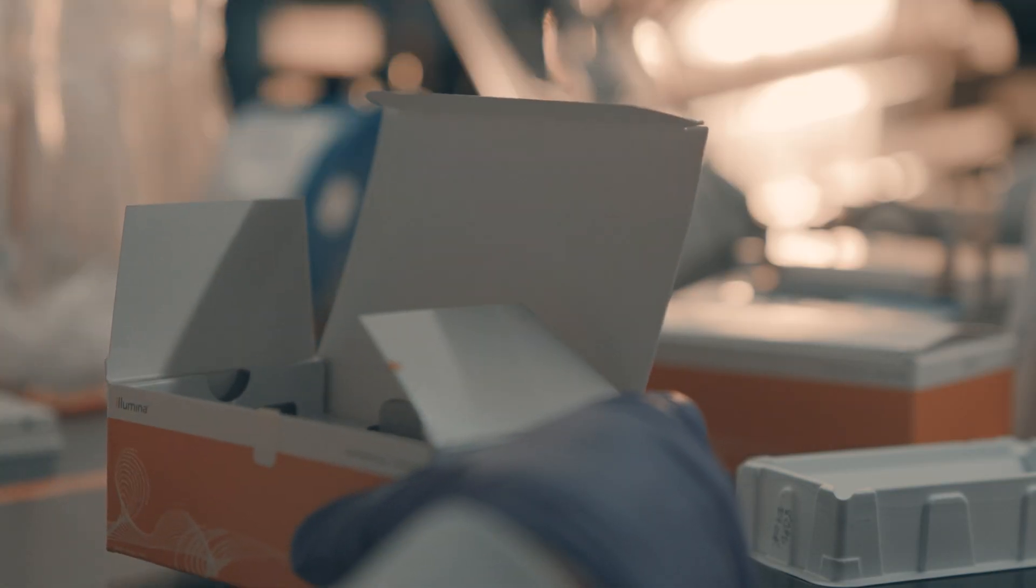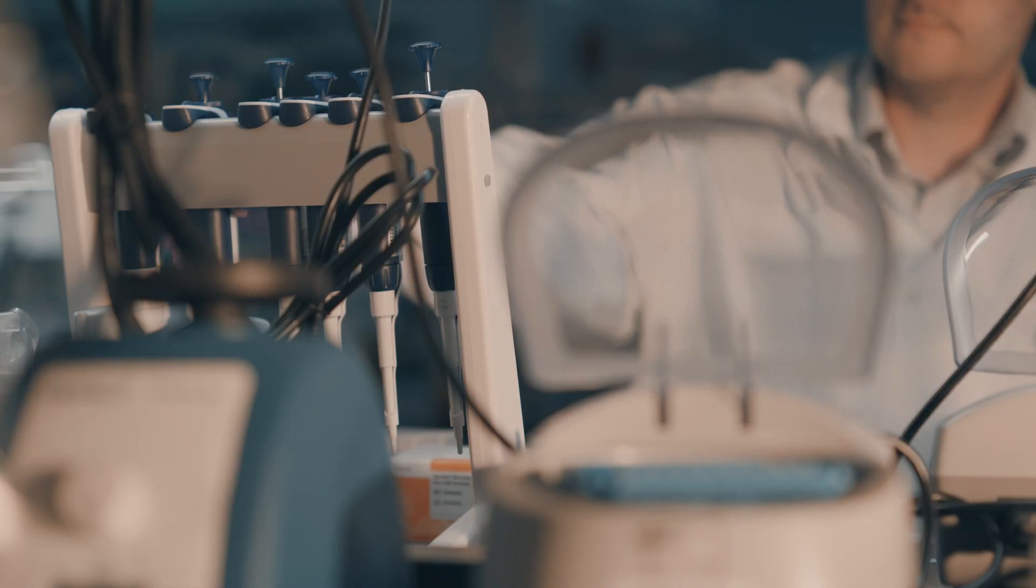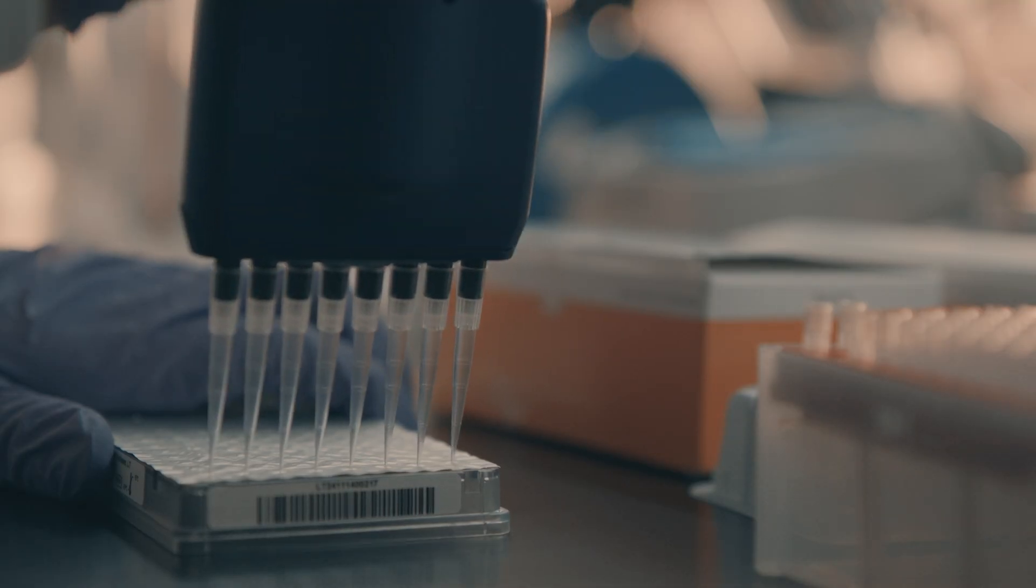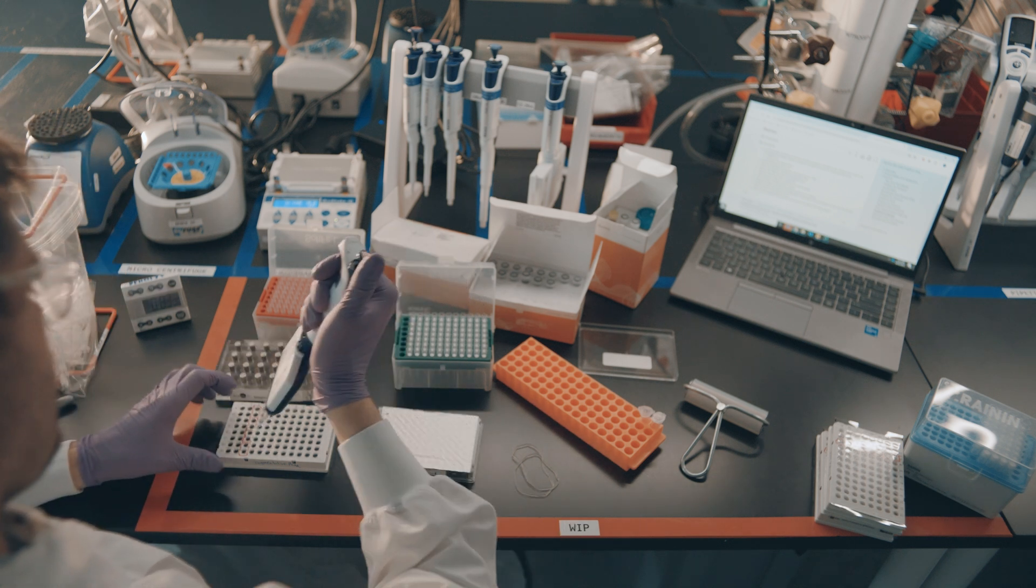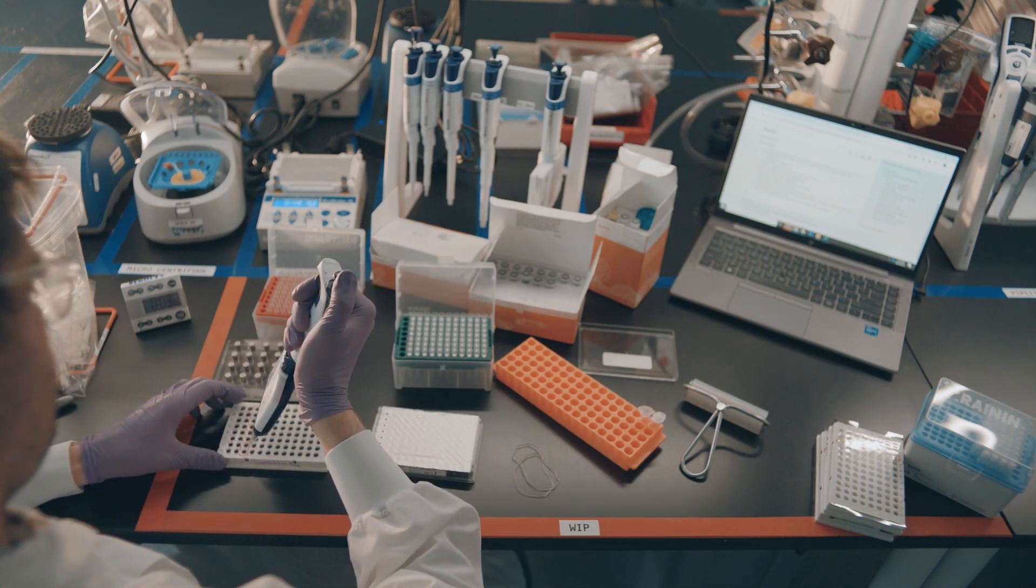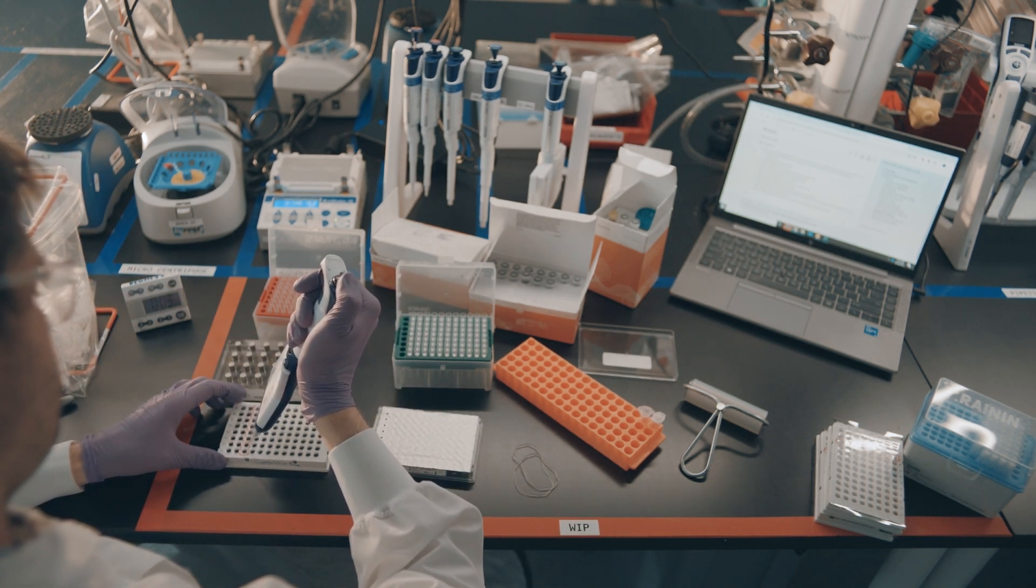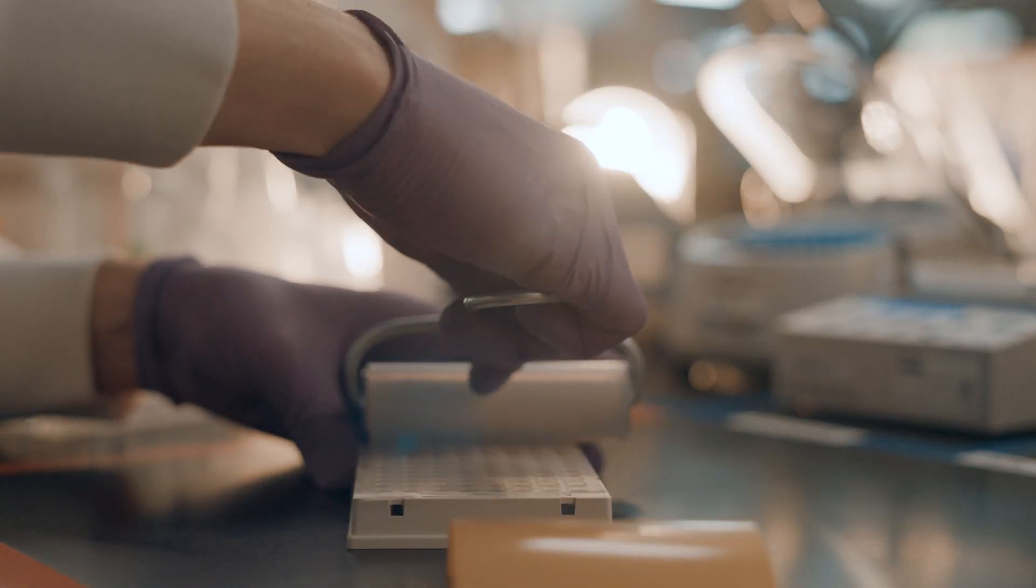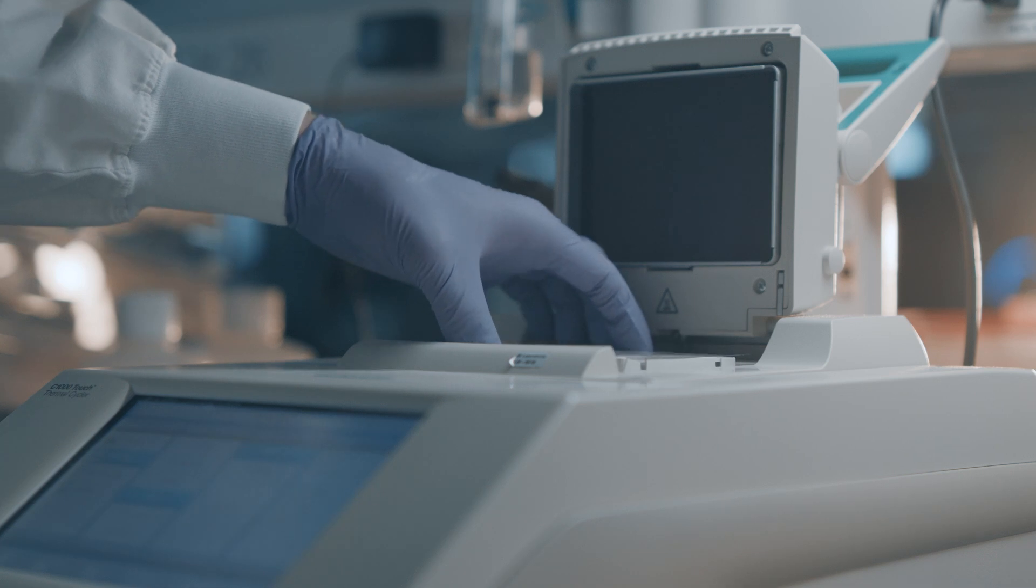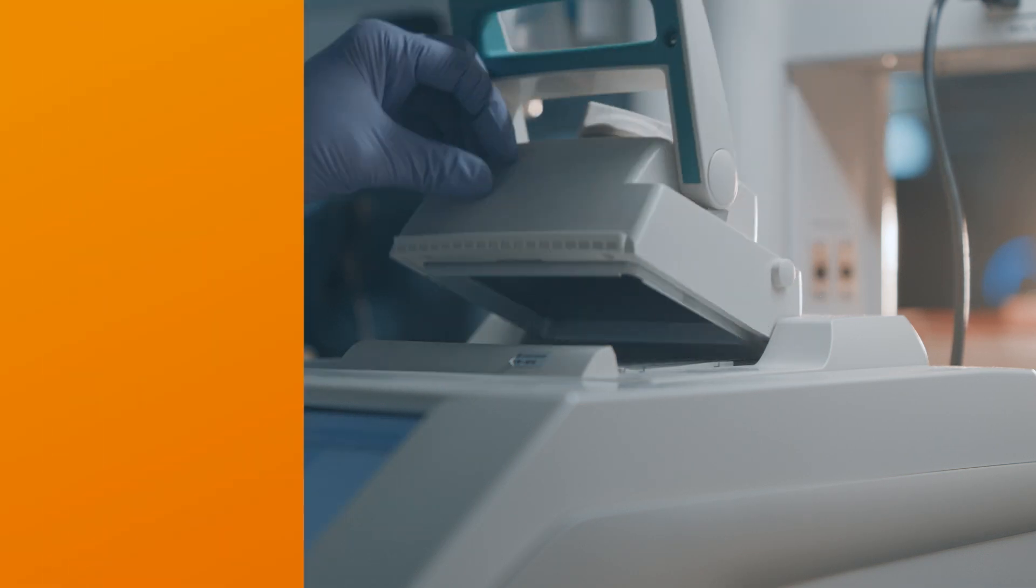After the wash steps are complete, users can add their indexes from the index plate, piercing the foil one column at a time. The user should be careful to not contaminate when piercing the index plate, as this can lead to inaccurate results. After indexes and PCR mix are added to the reaction, the user can transfer their plate back to the thermal cycler for indexed PCR.